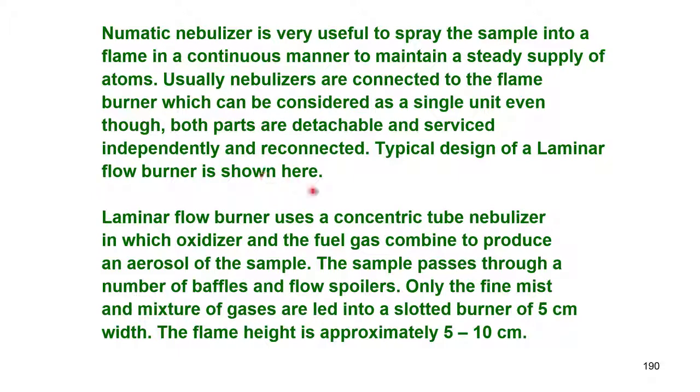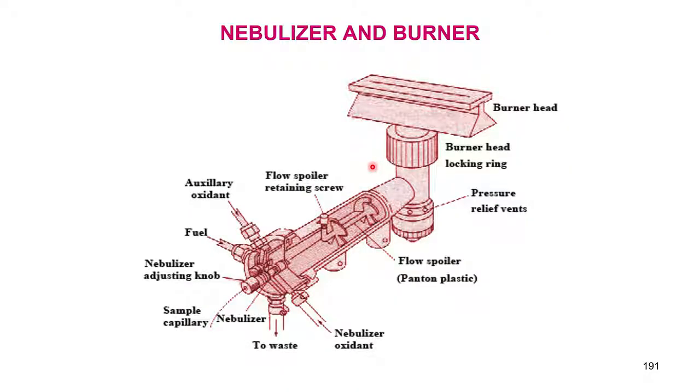So, a typical design of a laminar flow burner is shown here. This is the atomizer or nebulizer and burner assembly in an atomic absorption spectrometer.